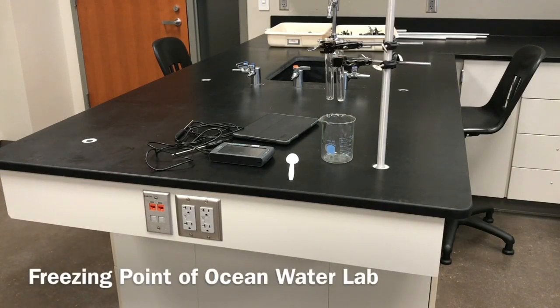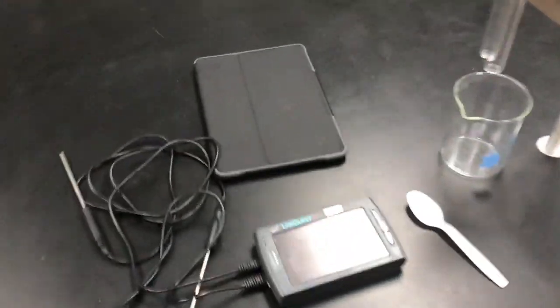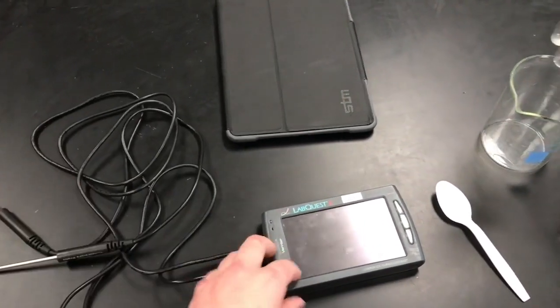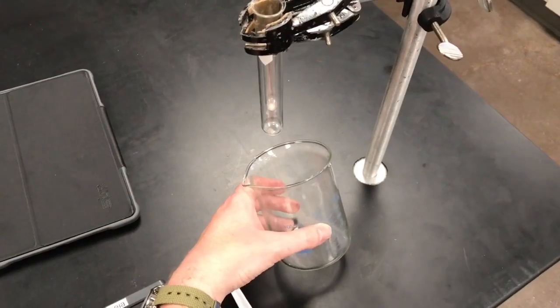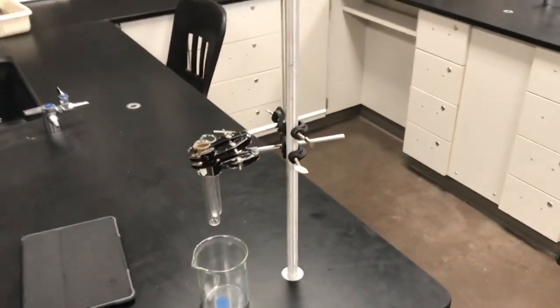Okay, so for this lab, we're going to be comparing and contrasting the freezing point of salt water versus fresh water. For our initial setup, you're going to need LabQuest. We're going to use two different temperature probes plugged into channel 1 and 2, a plastic spoon, a 400 milliliter beaker, two test tubes, our iPad, and we're going to need this double ring stand setup.